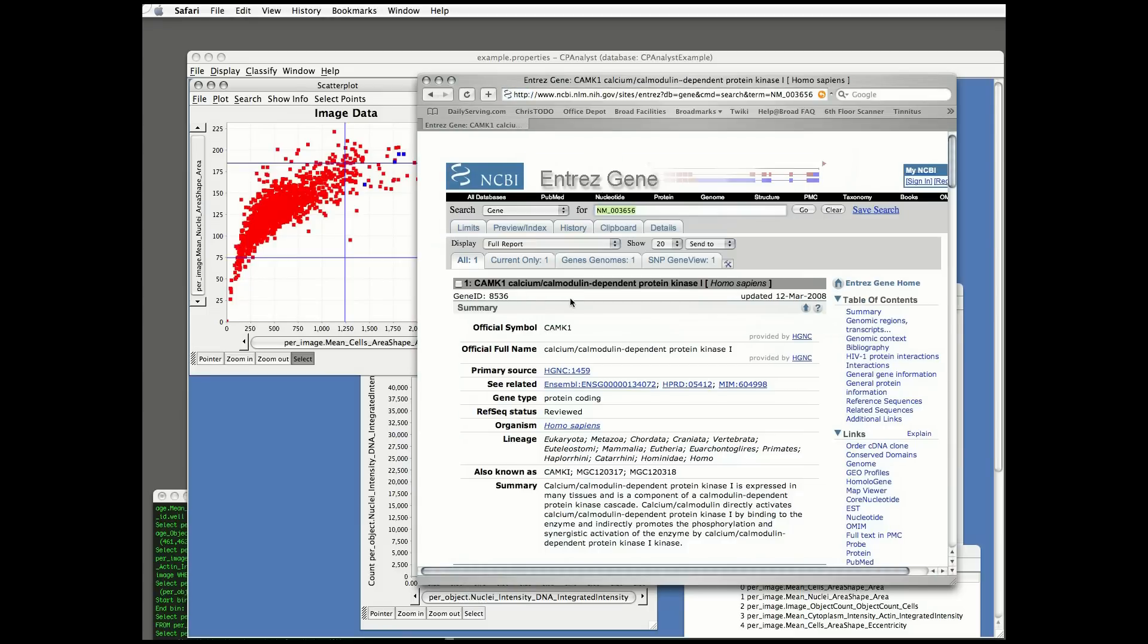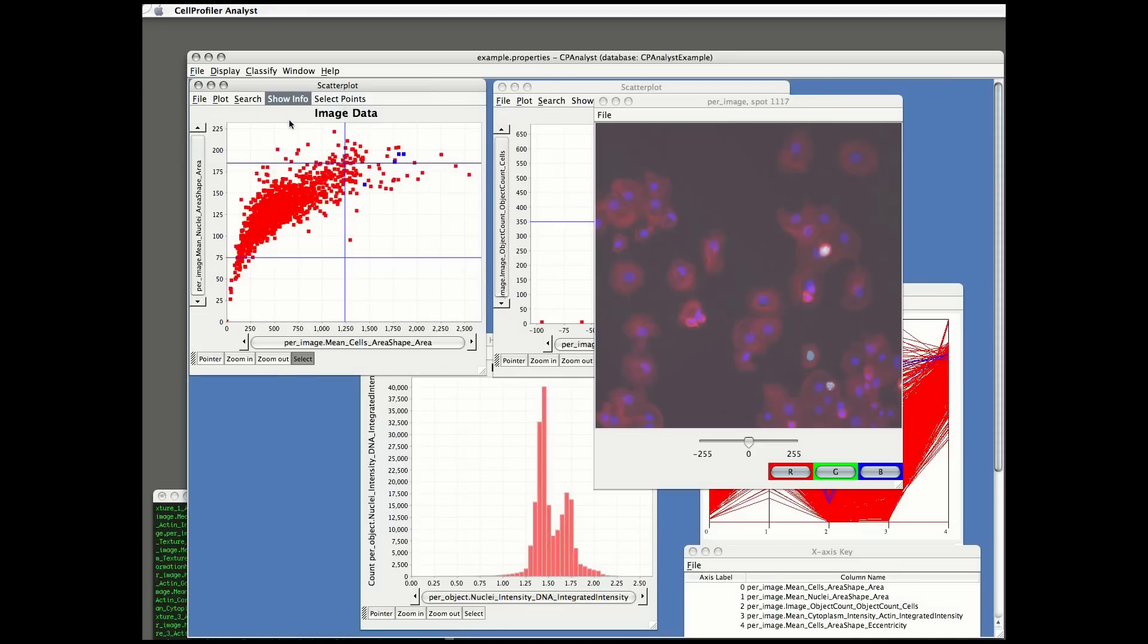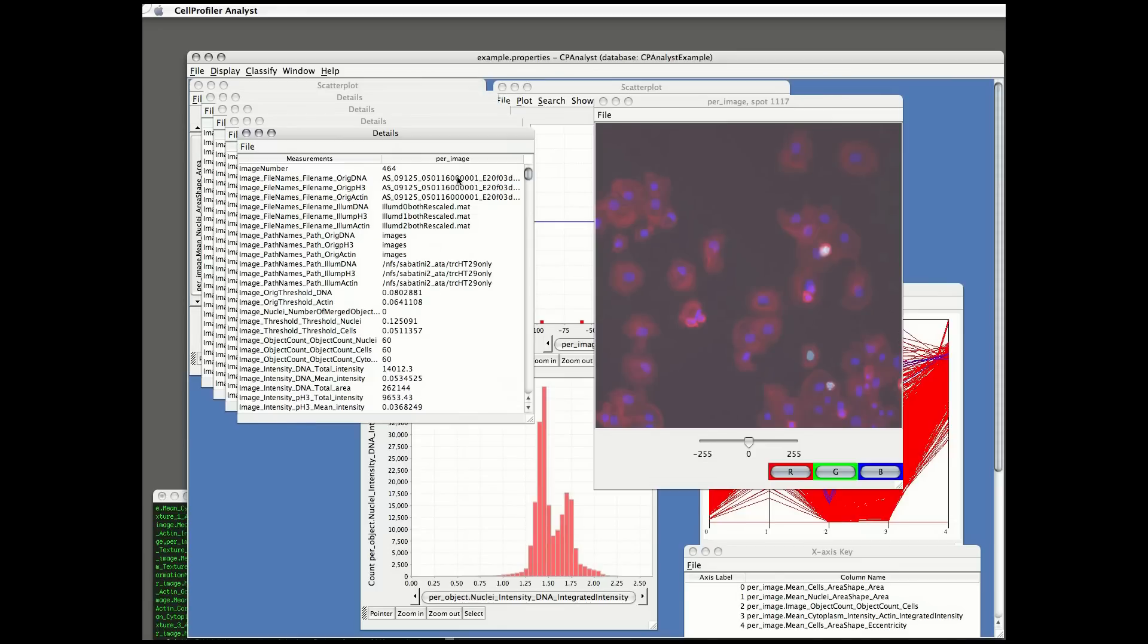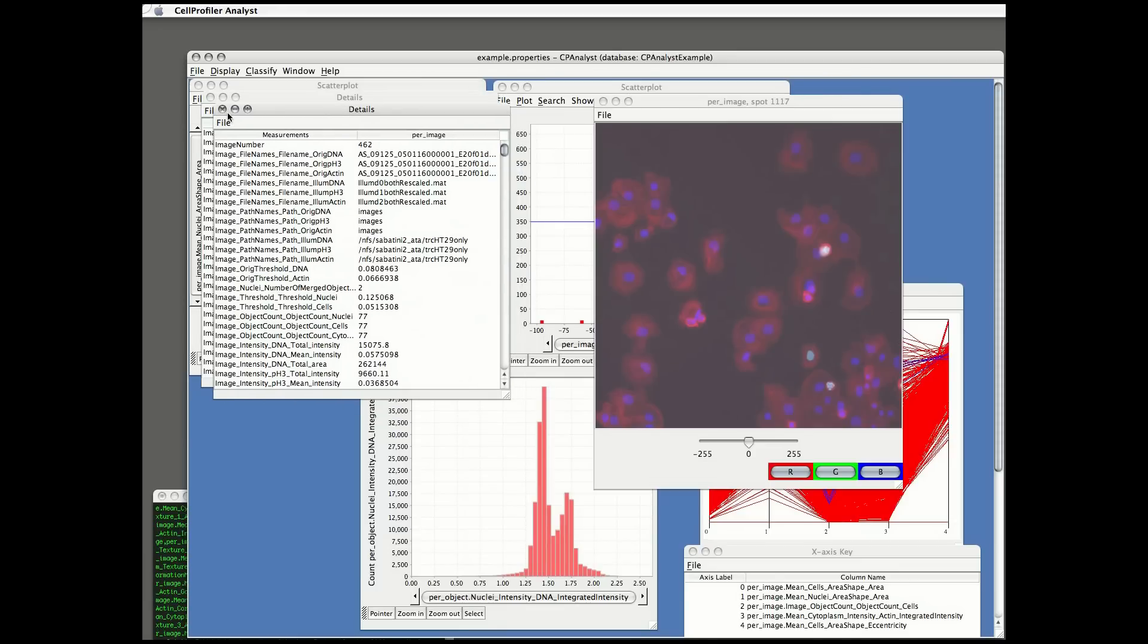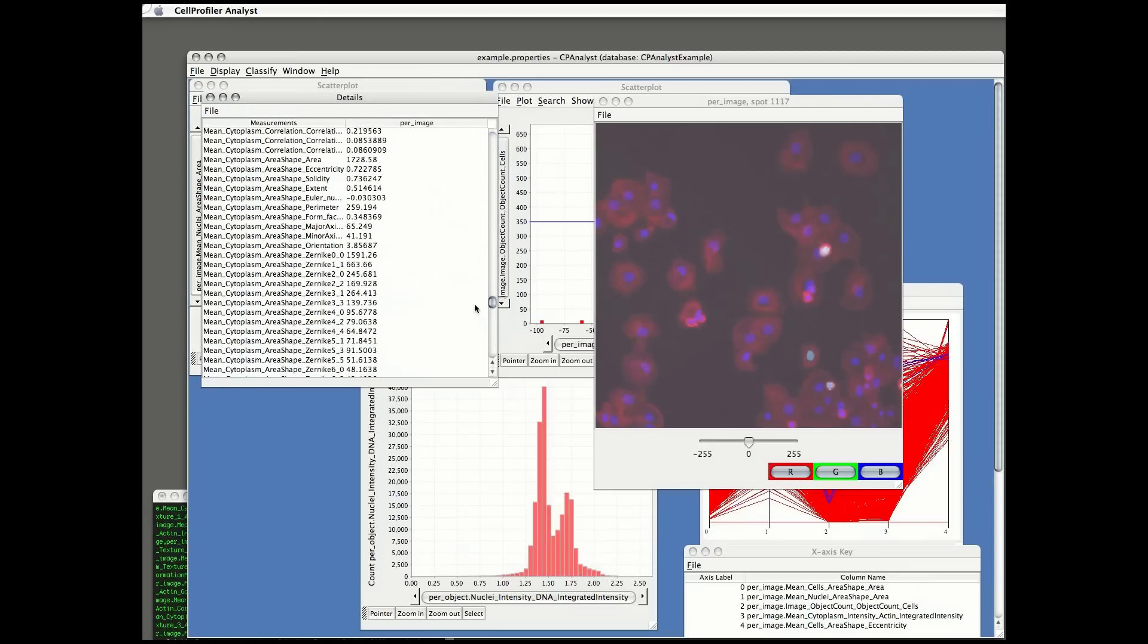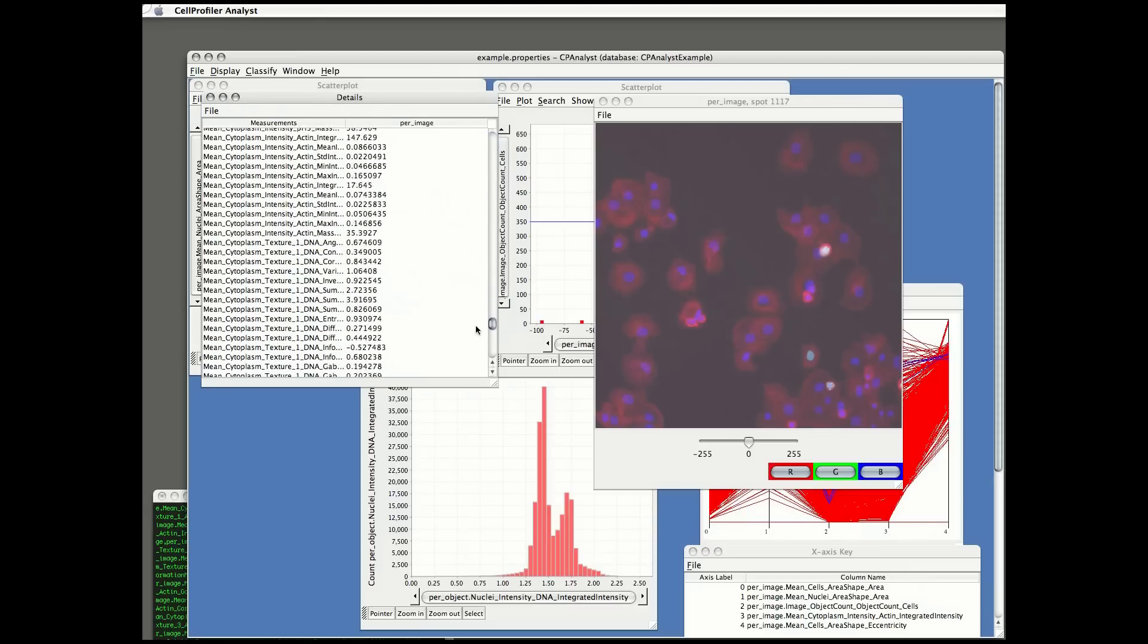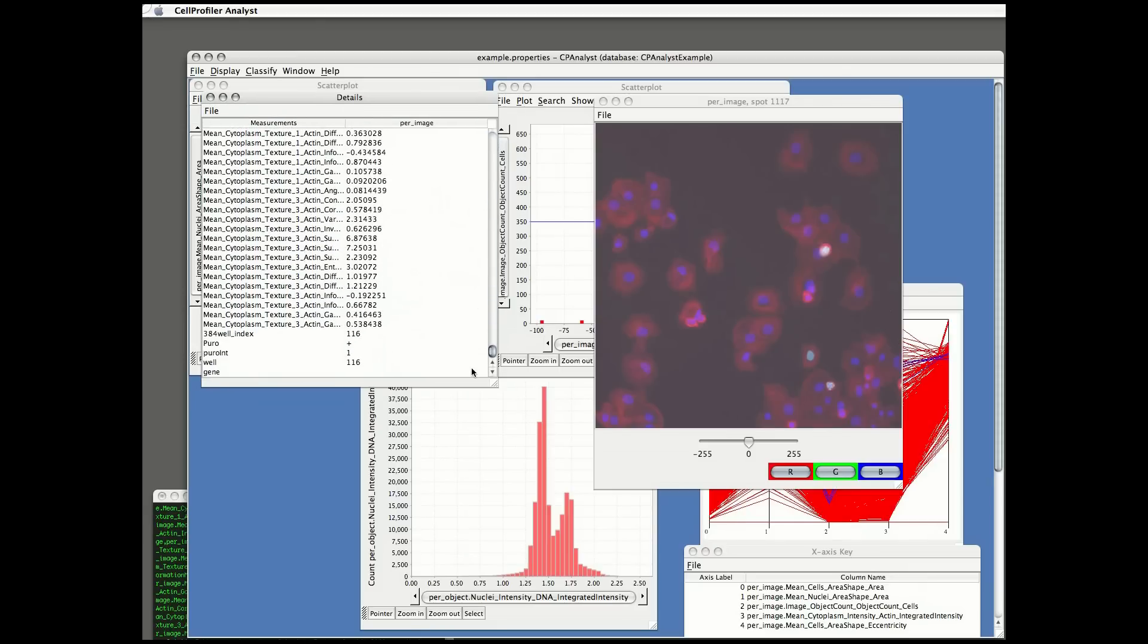I can look at the raw data of those four highlighted data points. These are four replicates of one particular type of sample. And I can take a look at the numerical measurements that are made, and I can also save the data, if I would like to, for just that one particular data point.